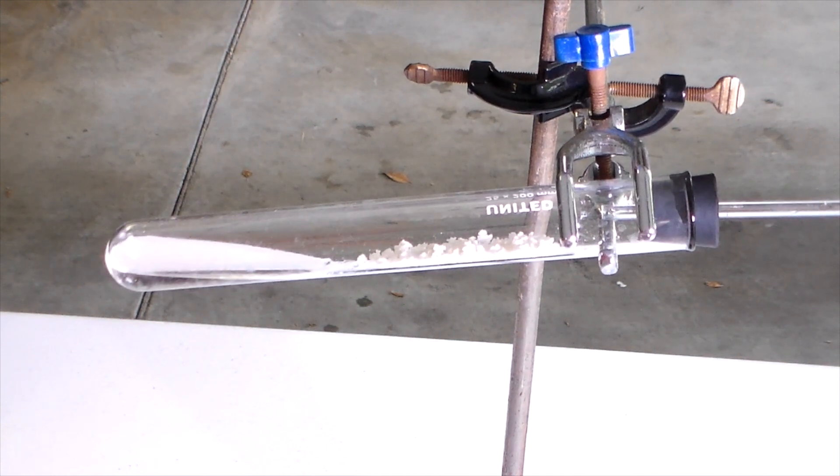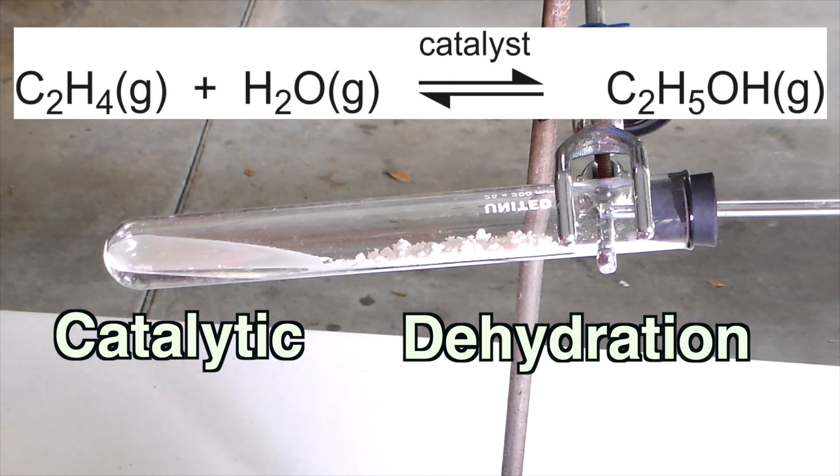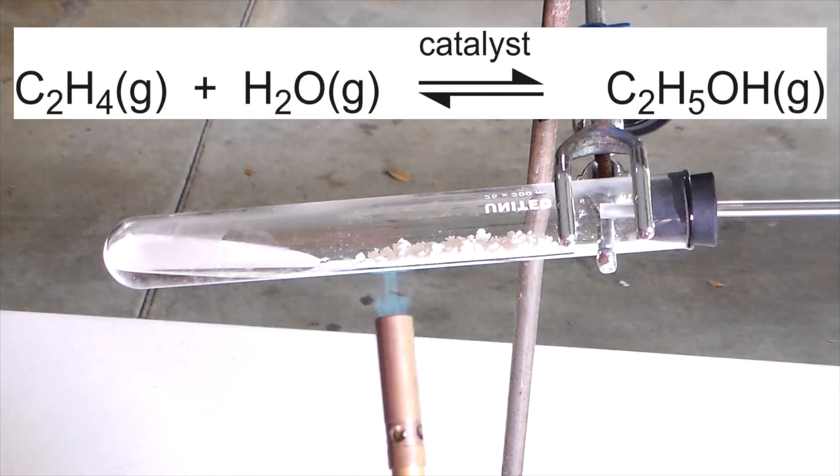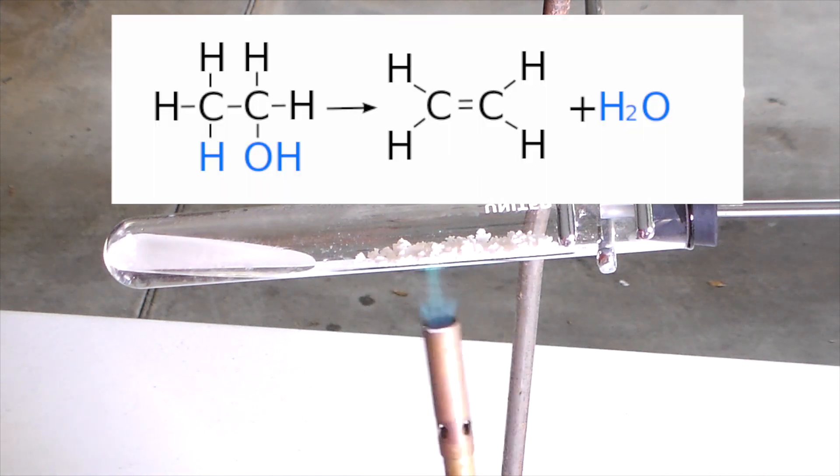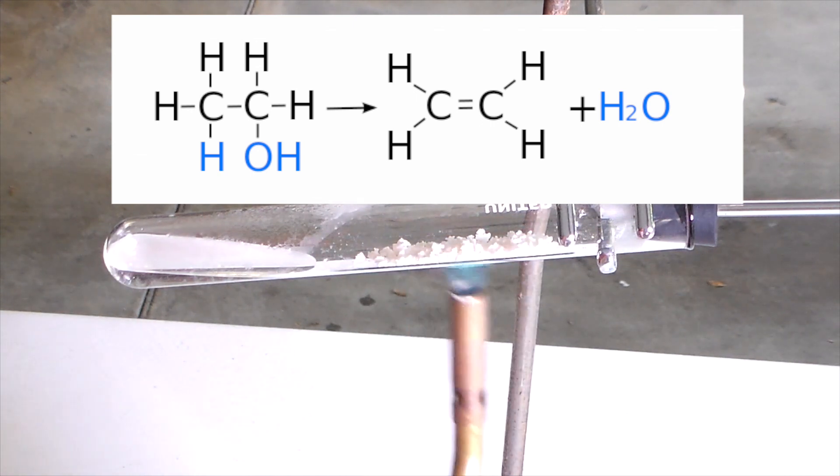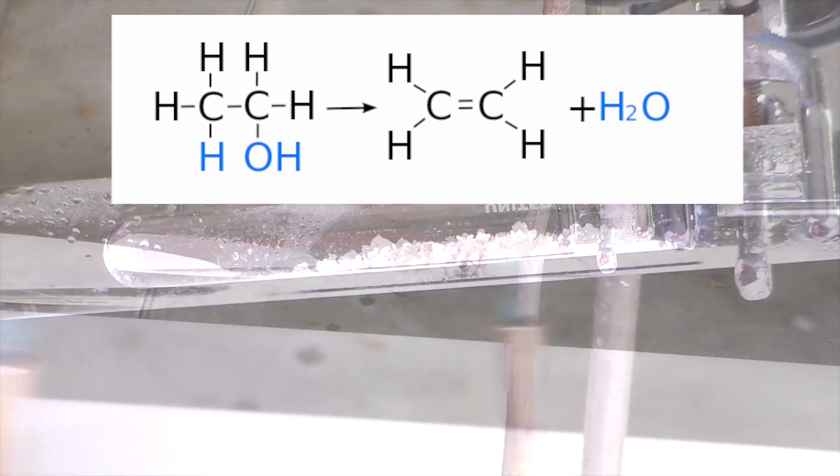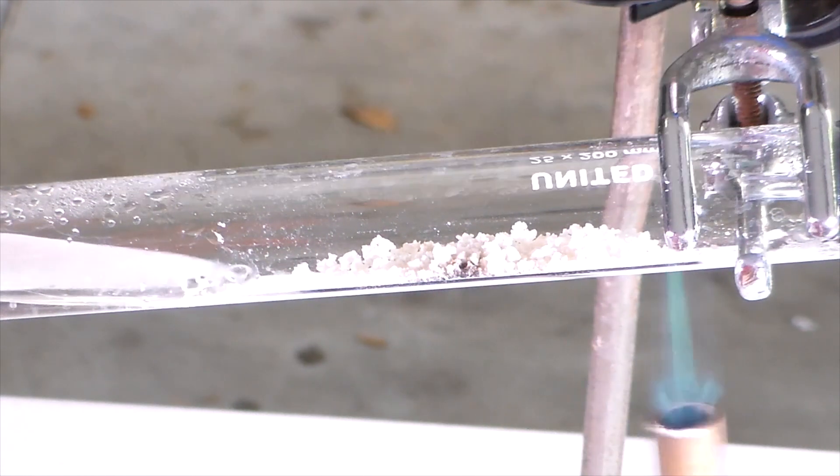The reaction we will carry out to produce ethene is known as a catalytic dehydration. The word catalytic indicates that we will be using a catalyst to facilitate this reaction. In this case, the catalyst is the aluminum oxide that we prepared in a previous video. The word dehydration indicates that we are removing a water molecule from the ethanol. In the equation on the screen, you can actually see where all of the atoms in the water come from. The OH of the water comes from the OH on the ethanol and the other hydrogen atom comes from one of the hydrogens on the other end of the ethanol molecule. Together, these form H2O and the two carbon atoms join together in a double bond. Anyway, that's enough with the theory, so let's get on to the actual reaction.